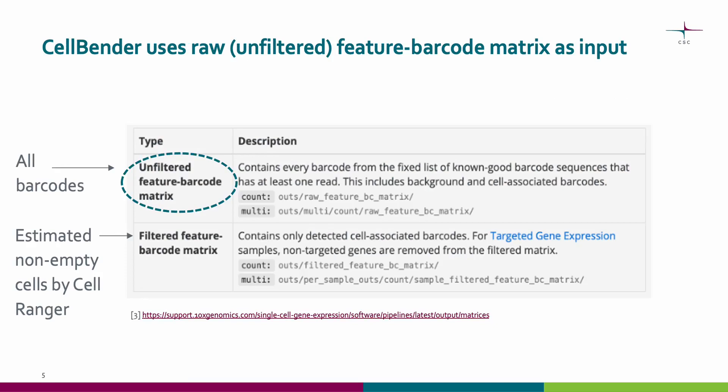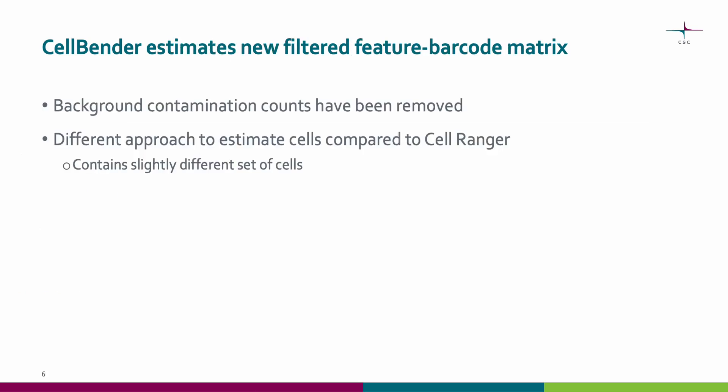We have learned to use CellRanger filtered feature barcode matrices for downstream analyses. With CellBender, we use raw feature barcode matrices as input. These raw matrices contain all barcodes that have at least one read, including empty droplets. CellBender estimates a new filtered feature barcode matrix of cells where counts from background have been removed. Because CellBender uses a different approach to estimate cells compared to CellRanger, the estimated cells in the new filtered feature barcode matrix might be slightly different.